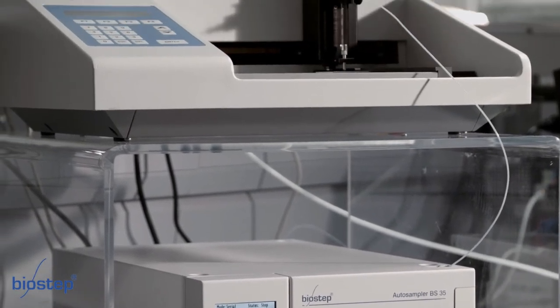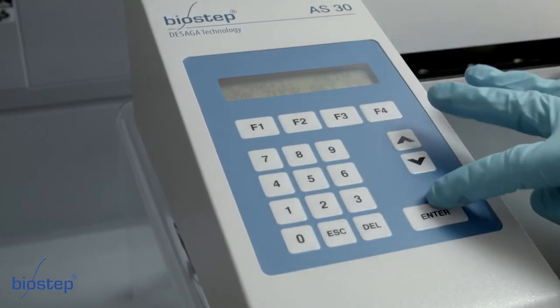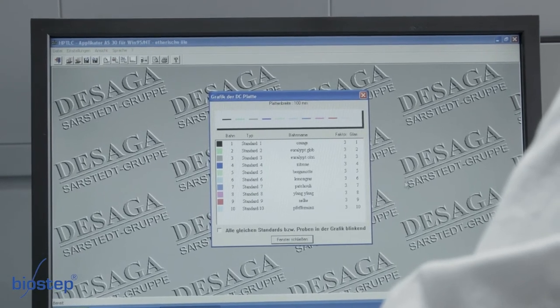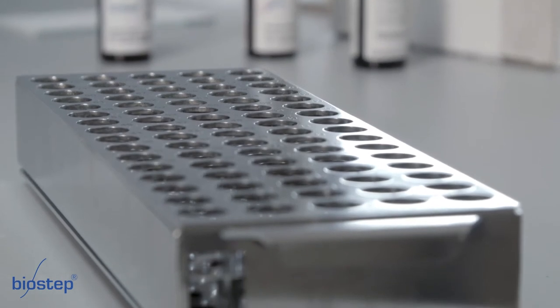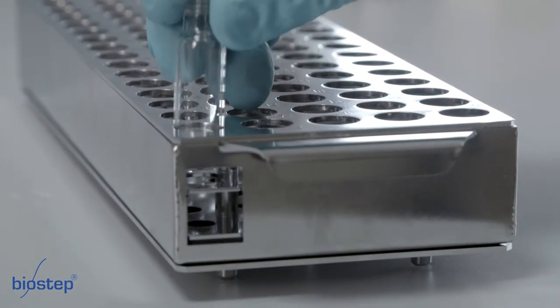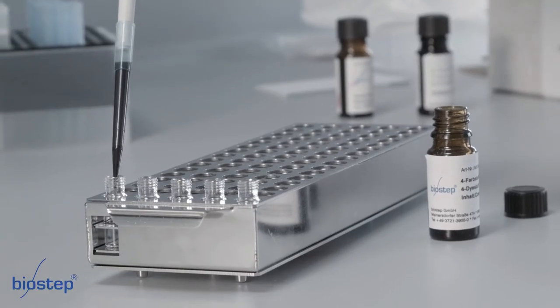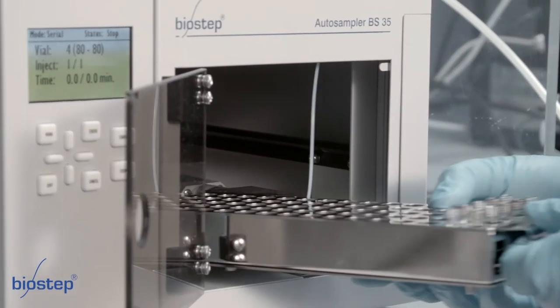A compressor supplies the applicator with compressed air. Select your program at the AS30 and write down the positions of your sample vials on the sample rack. The sample rack can hold up to 80 sample vials of 1.5 milliliters each. Position the sample vials in the rack according to the program of the AS30 and fill them with the samples.